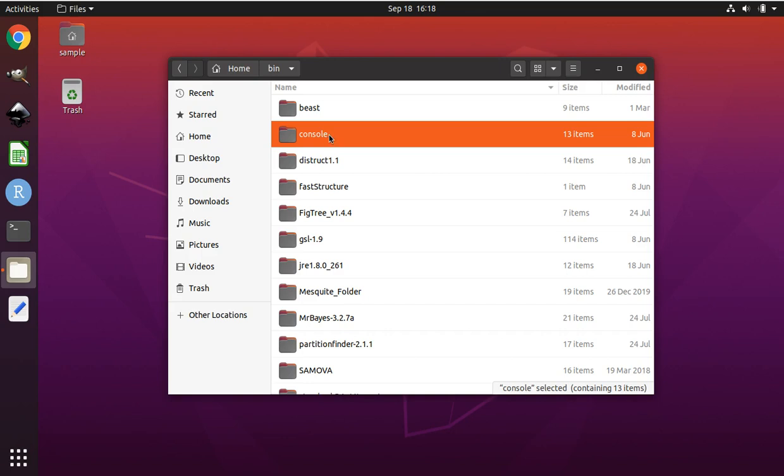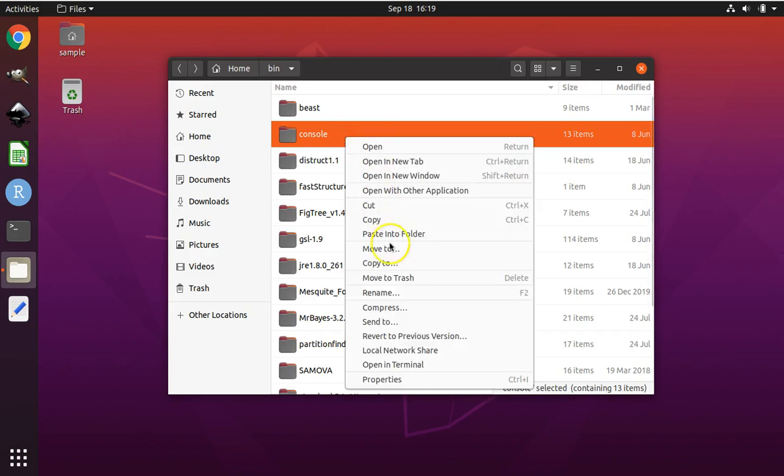So here's what I recommend you should do. These steps I'm recommending for you are if you were using your own data and you're using this tutorial to help you, but you're working with your own real data, not sample tutorial data, and you don't ever want to lose it. If you are on a Windows machine or have a Windows type mouse, right-click. If you are on a Mac laptop, push down on the trackpad with 2 fingers and select Copy.